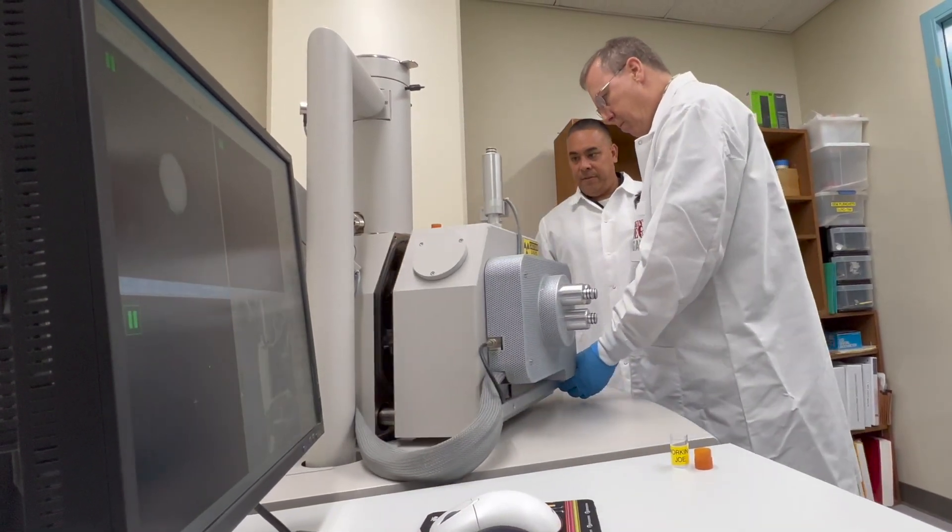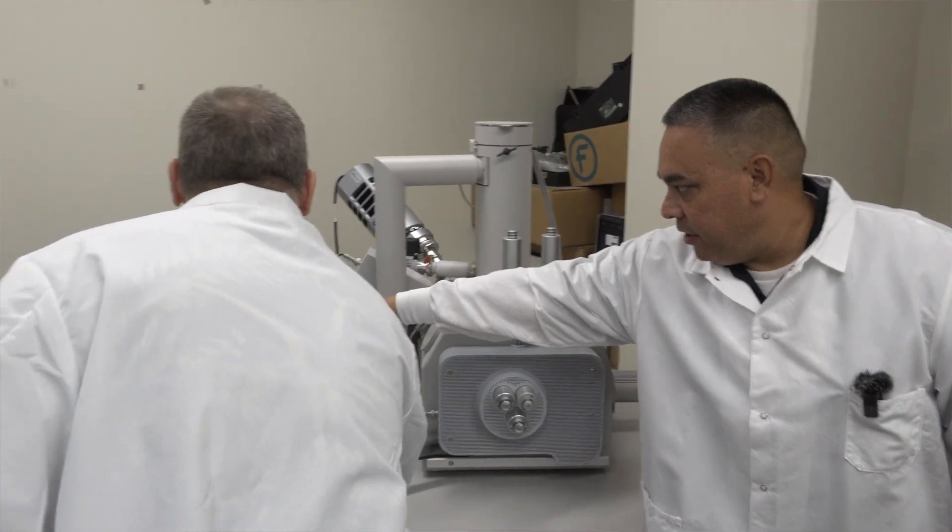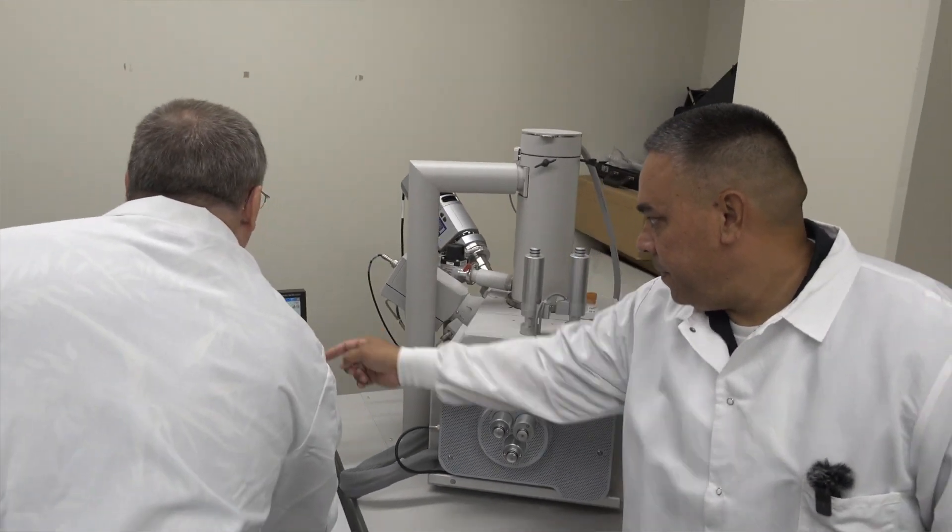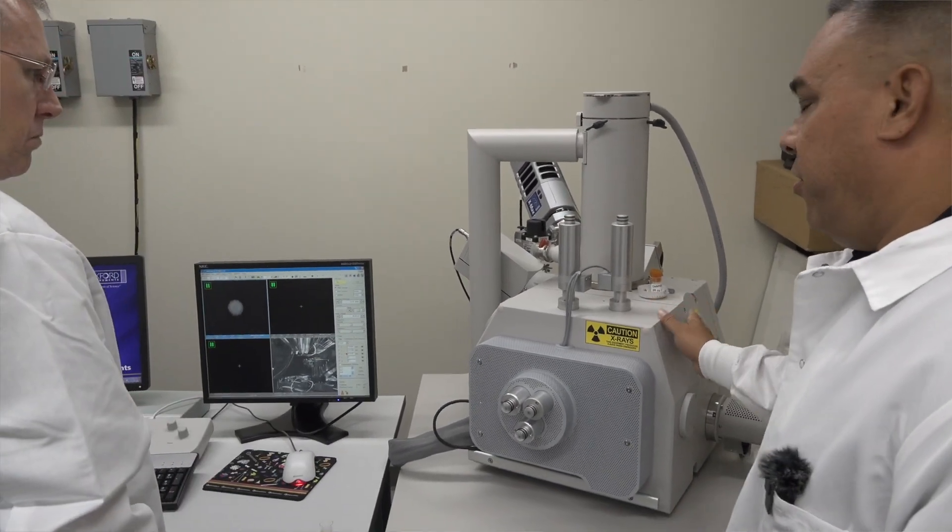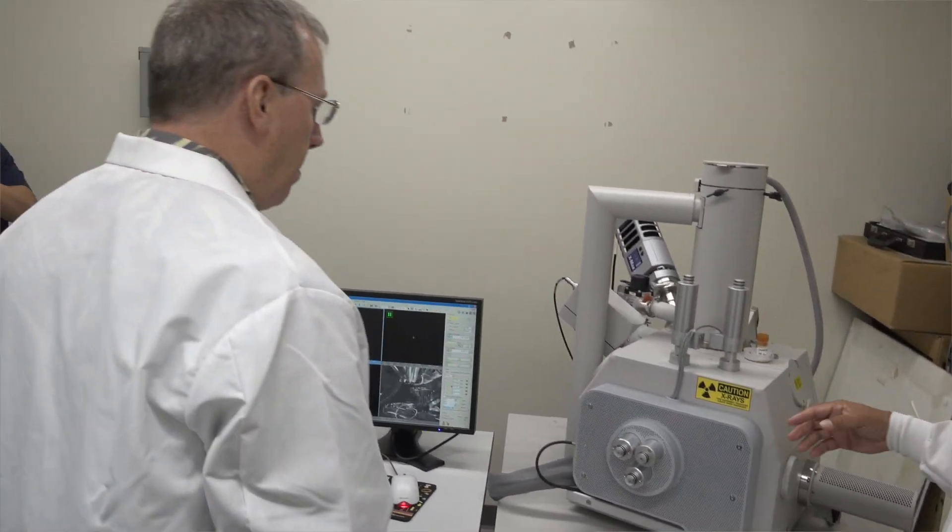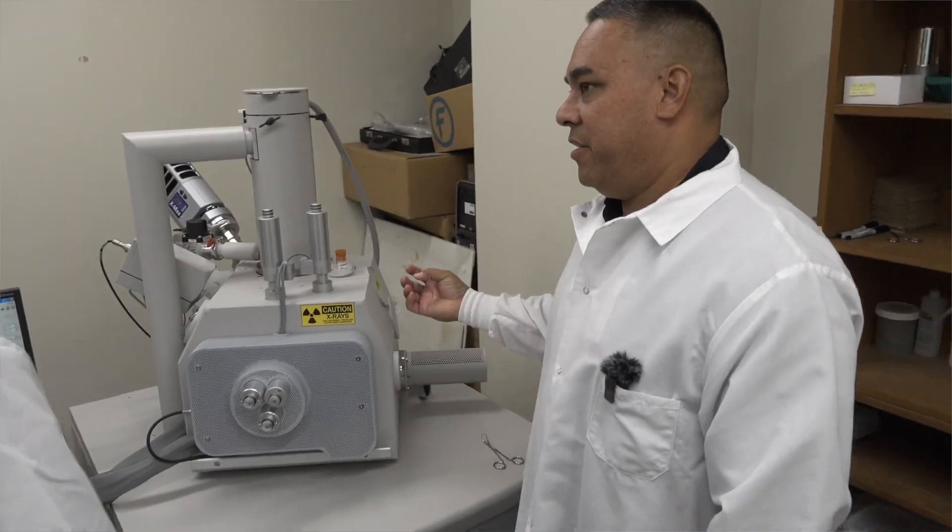All we do is just close it right there and click on pump and what it's going to do is it's going to start pumping down the chamber. It's going to take out all the air from the chamber. We need to have a real strong vacuum in here.